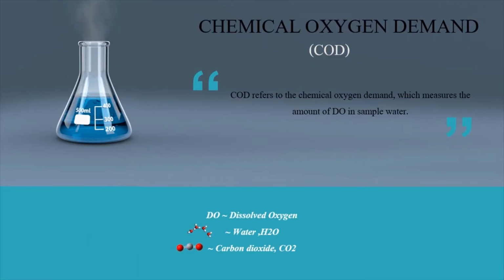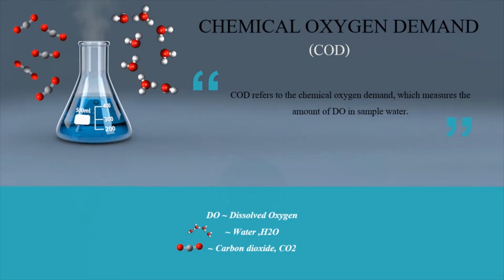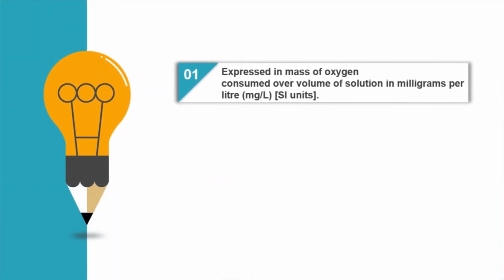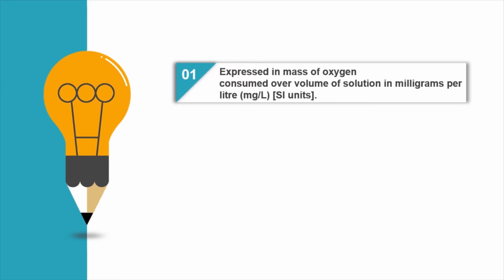What do we know about COD? COD refers to the chemical oxygen demand, which measures the amount of dissolved oxygen in sample water, which converts organic compounds to carbon dioxide and water. Expressed in mass of oxygen consumed over volume of solution in milligrams per liter.